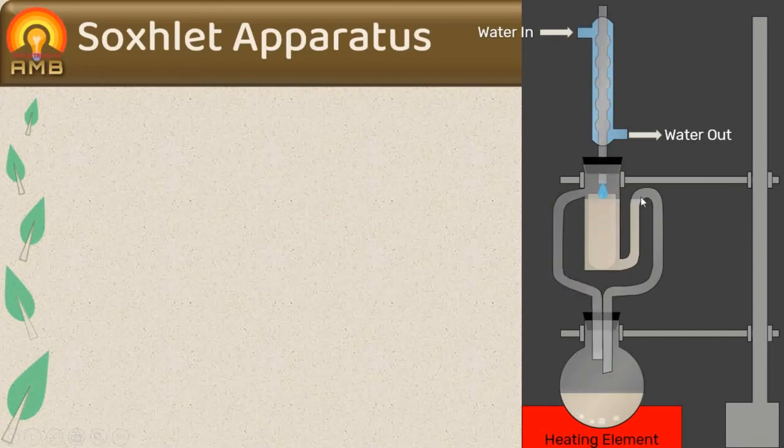The white tube becomes empty. As active constituents are non-volatile in nature, menstruum again vaporizes and enters the condenser through the side tube and the cycle continues. The same menstruum is repeatedly used for extraction of the drug and the active constituents present in the flask become concentrated. The process is continued till all the drug is exhausted. Normally 15 cycles are repeated for complete exhaustion of the drug.